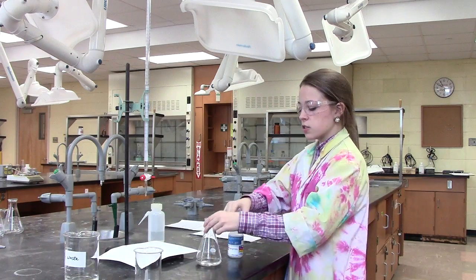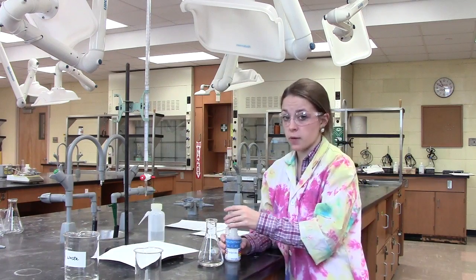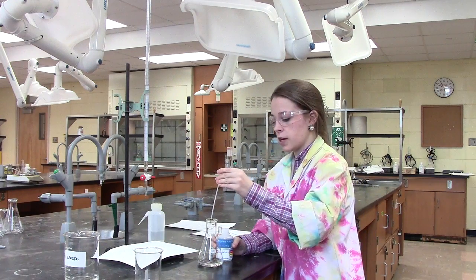I'm now about to add a couple drops of indicator to our unknown solution. This will allow us to be aware of when the endpoint is reached. In this case, I'm using phenolphthalein as an indicator.